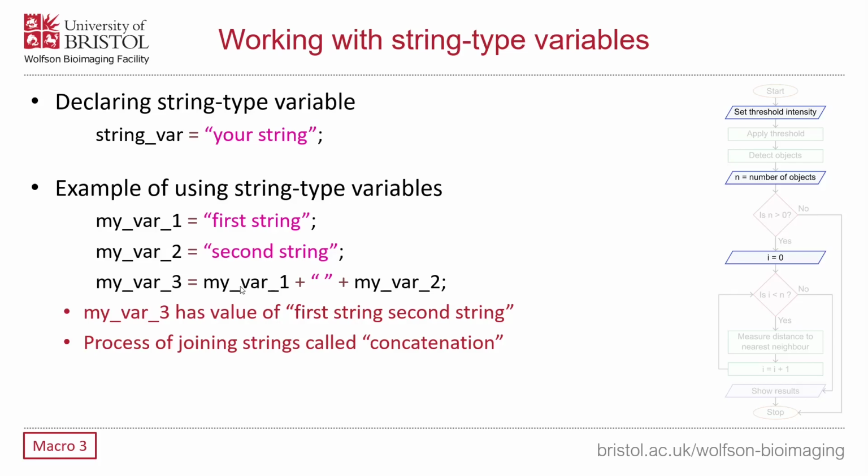You can even do basic operations, should we say. This one here is concatenation. So if we're assigning two different variables here to different strings, so we'll just call it first string and second string, we can use the plus sign here, and effectively it's just bolting one after the other. And again, we're mixing, as we did with the numeric example, variable-based values with hard-coded values here.